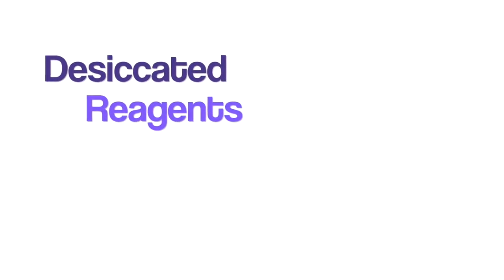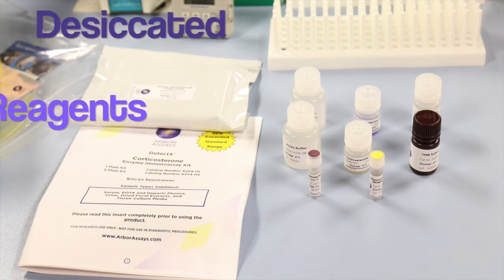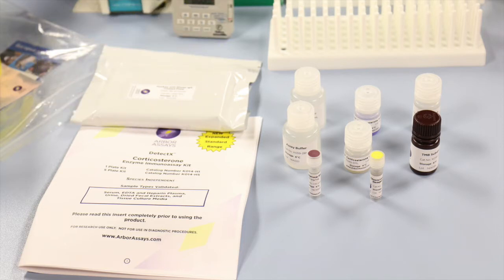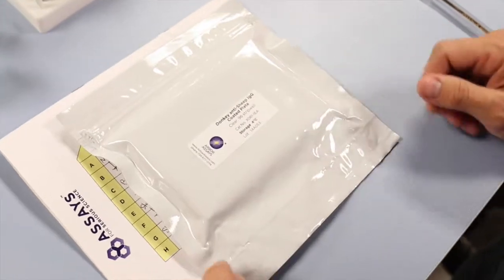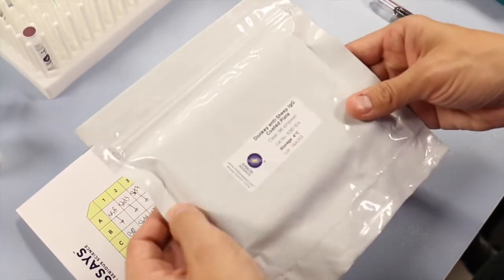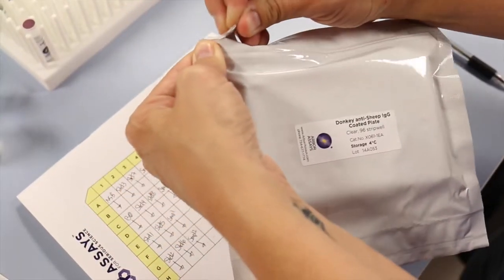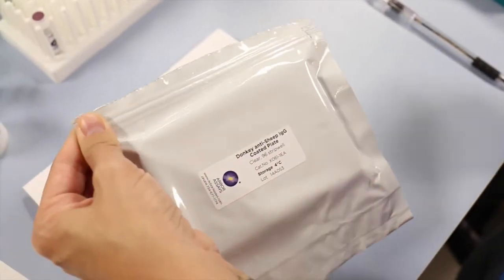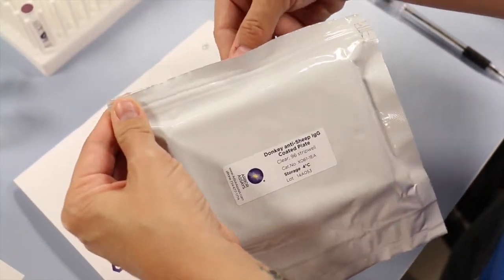Allow any components that contain desiccants, such as our DetectX coated immunoassay plates, to warm completely to room temperature. Opening desiccated packs prior to reaching room temperature will allow warm, damp air to settle on the cold component and hydrate it. This may damage the component.